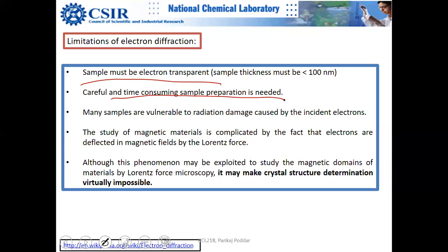The life of biologists who are working with electron microscopy is also not easy. They also need to do a lot of cryo microtomy. They need to freeze the sample and then cut them and then mount them. They need a cryo TEM holder, and it's quite tricky actually. For proteins, it's another challenge. And there is a contrast problem. They need to stain it. So again, I'm giving you two extreme sides. Biologists spend a lot of time with sample preparation. Relatively, your life is much easier at NCL if you are a chemist. Okay, feel happy.